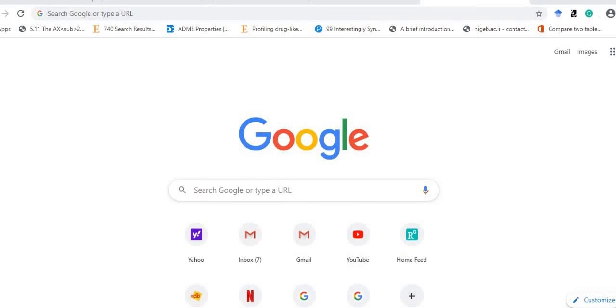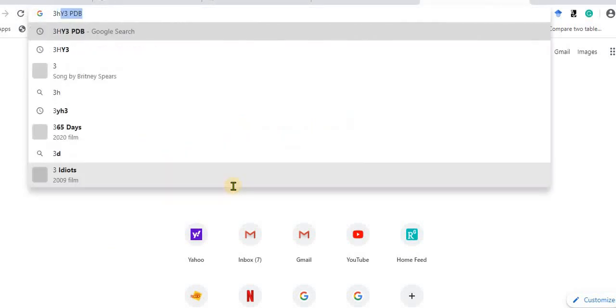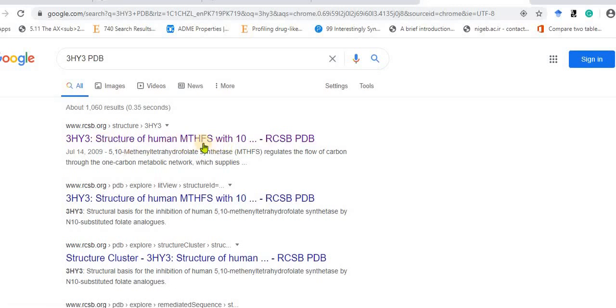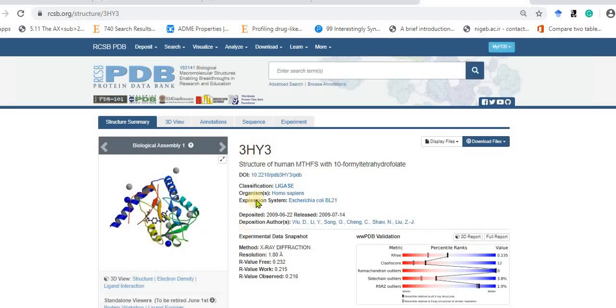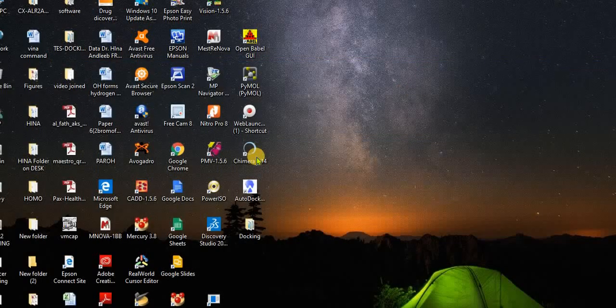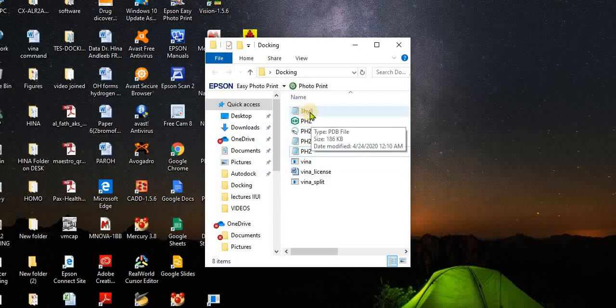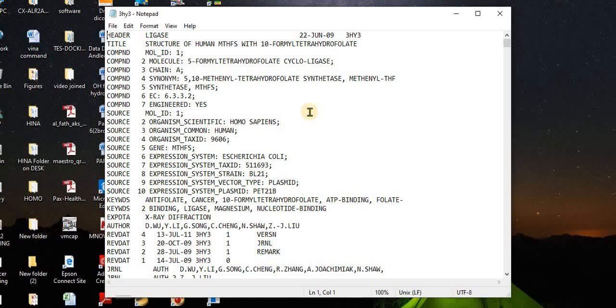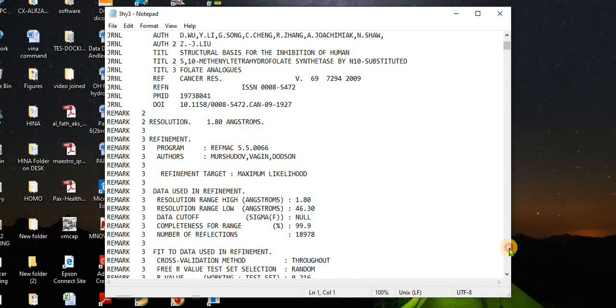First of all, we are going to take the PDB of our target protein. Our target protein PDB ID is 3HY3. This is the structure of human MTHFS. You can watch my previous videos for downloading PDB files. From this site you can download the PDB. You can click on PDB format to download the file. I have already downloaded the PDB file into my working folder. Here is the PDB file of 3HY3. When it's downloaded, you can paste it in your working directory.